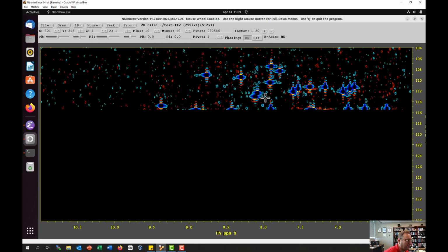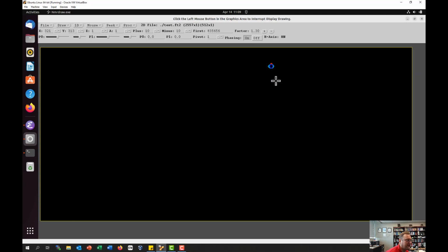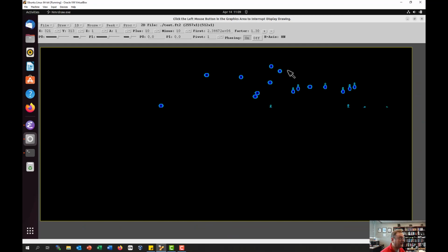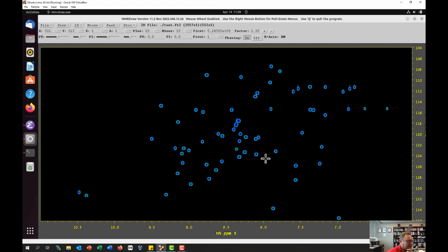Okay. And you can always interrupt this by just clicking in there and then just redrawing it. And if you're not happy with the first bit and you're sick of waiting, you just keep doing that until you are happy. But this is fine. Again, I'm convinced that this is in phase. And so we don't need to look at all that noise, particularly if we're doing an assignment project, and it does save some time because it takes less time to regenerate.